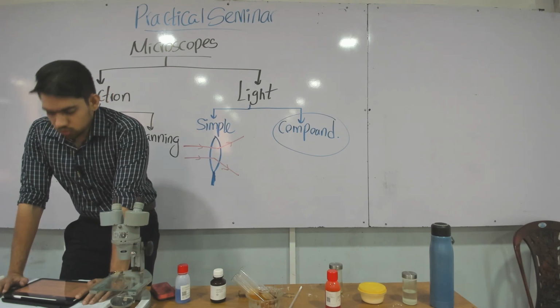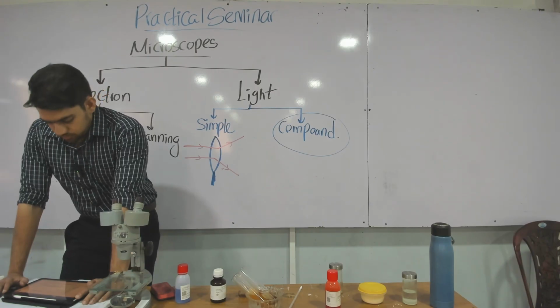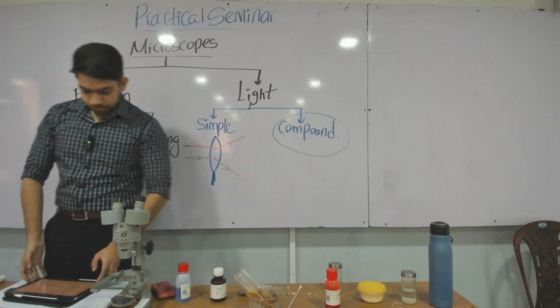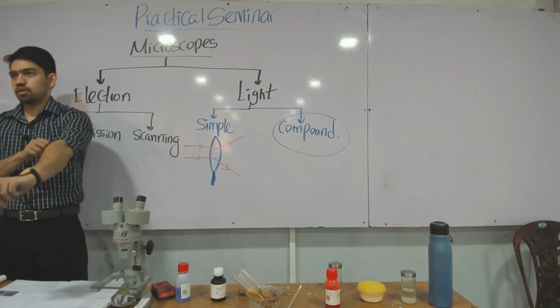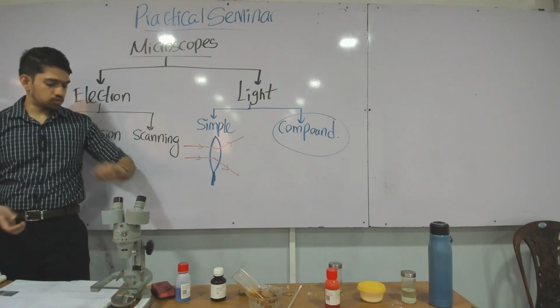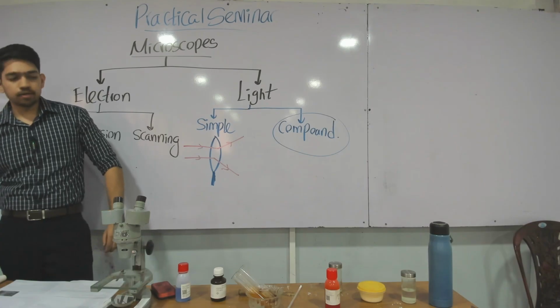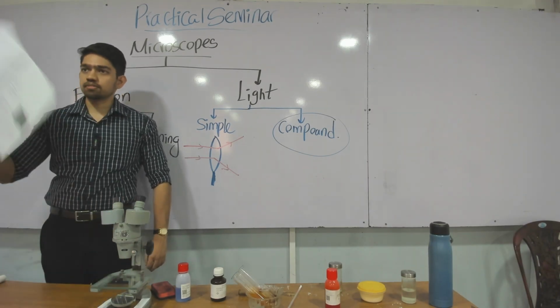The simplest microscope is a single lens. Underline that. They can ask you what a simple microscope is. Compound light microscope. We'll discuss the compound light microscope and the things in the resource book later, and come to the question tube.